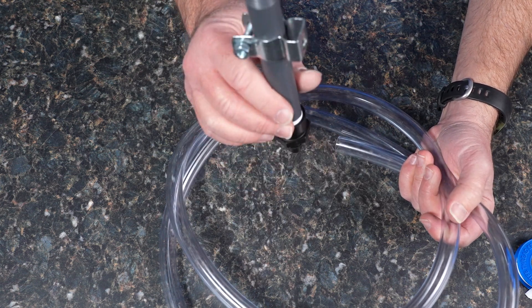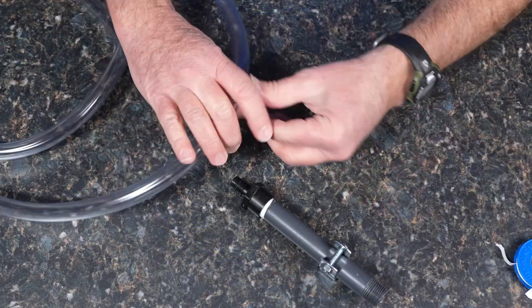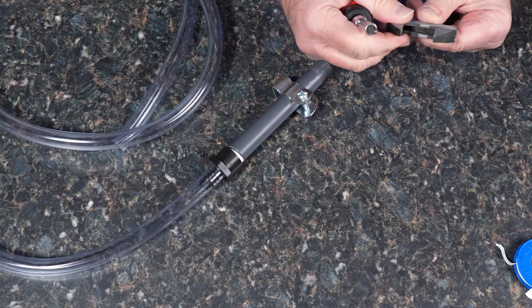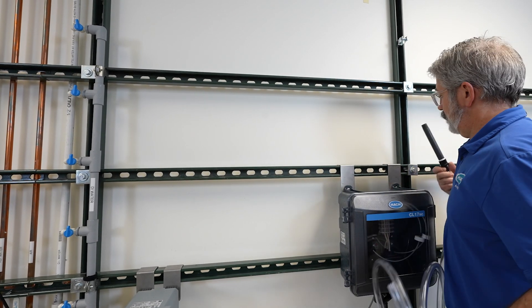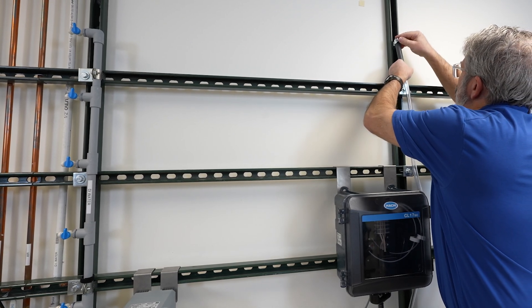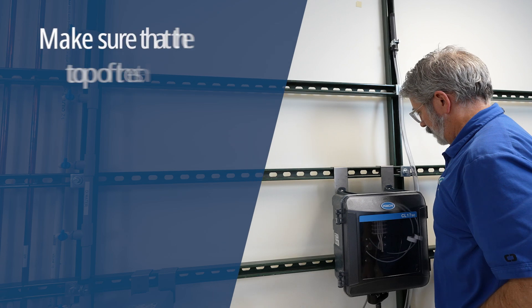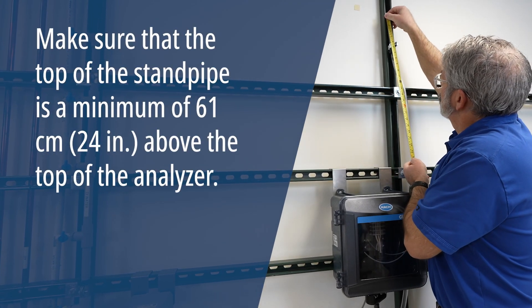Assemble the standpipe before you begin installation at your location. Make sure that the top of the standpipe is at least 24 inches above the top of the analyzer.